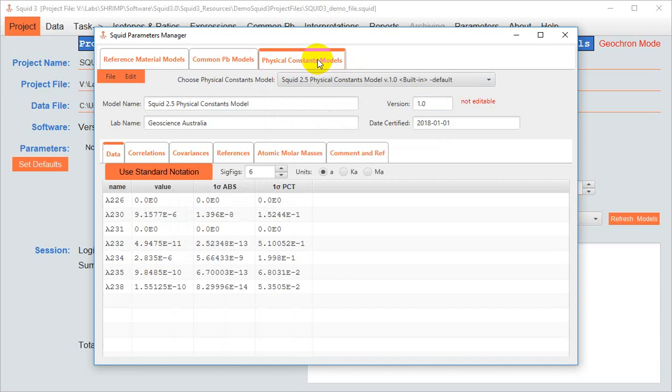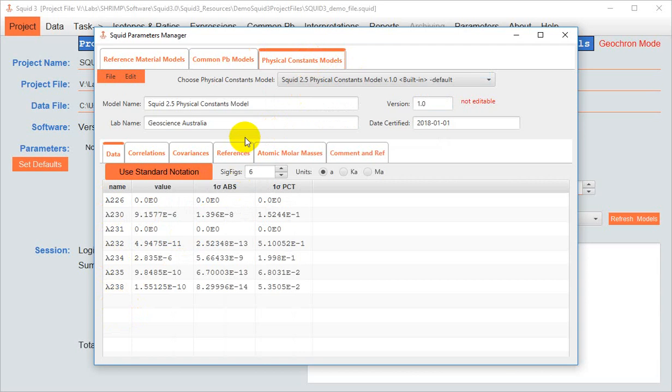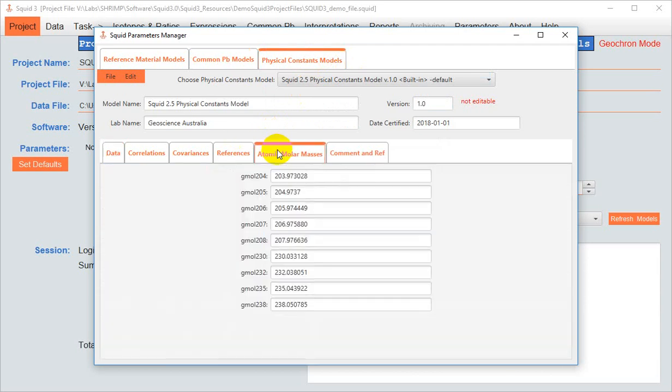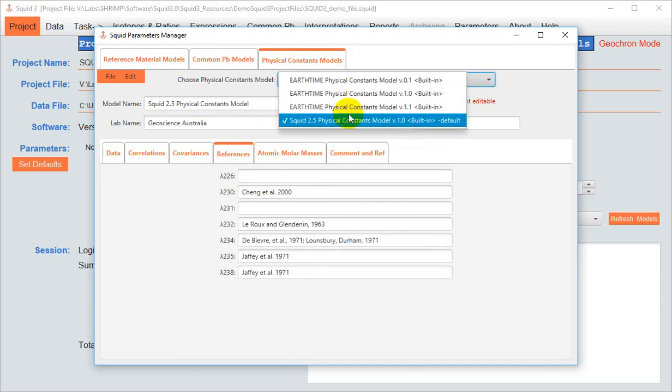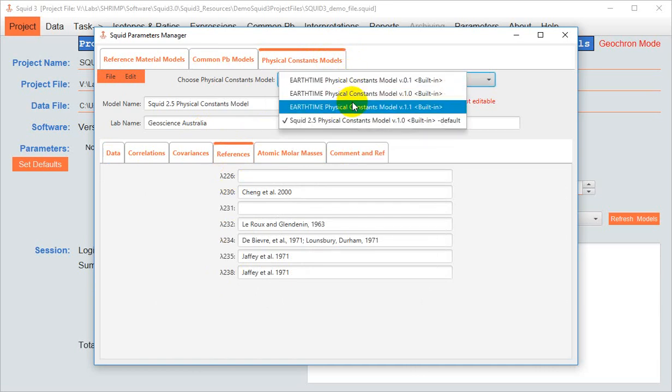Finally, the Physical Constants tab takes the values used by SQUID3, for example, for the decay constants, atomic molar masses. It shows the references for those. Some of the other models available to you here are used by EarthTime.